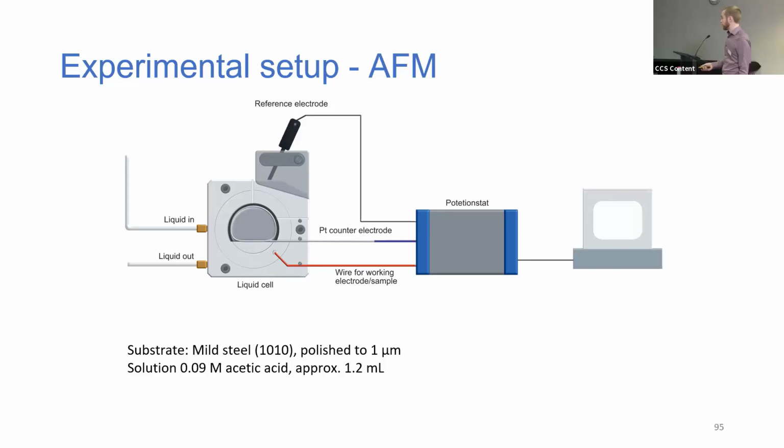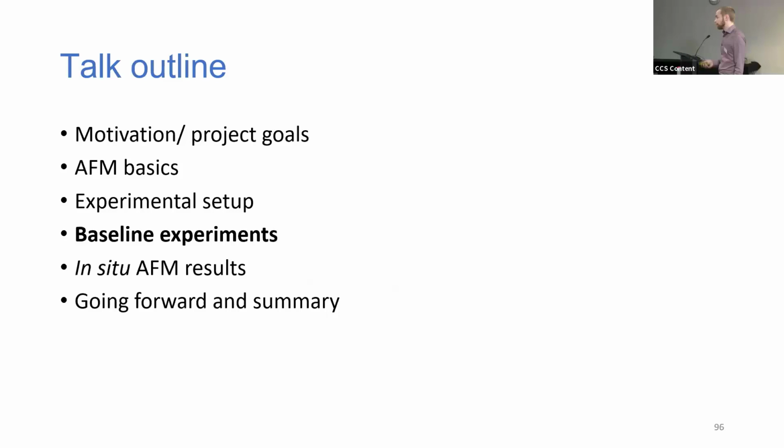Our substrate is mild steel 1010, polished to 1 micron, and our solution is a 0.09 molar acetic acid solution, approximately 1.2 millilitres. You may notice that this is quite a small volume, so we thought it necessary to do some experiments to compare to larger volume solutions.